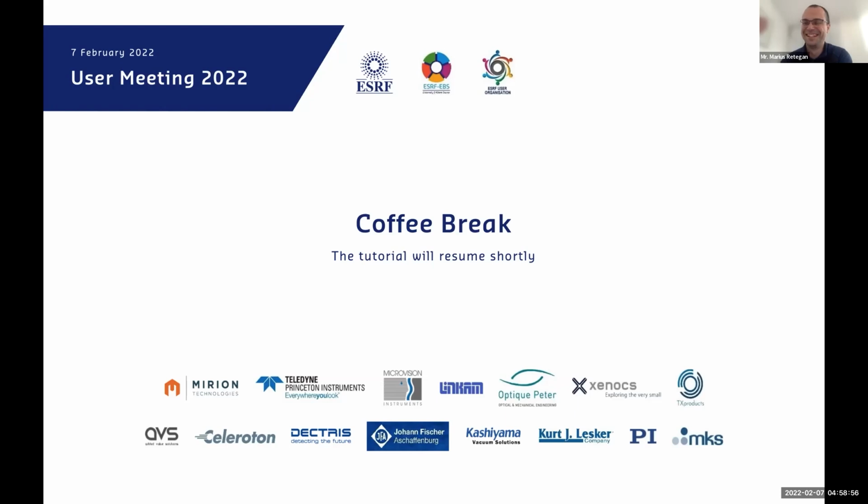General one. So your code was specifically developed for ID26, or is it broader? Yeah, because ID26 and ID20 have different ways of acquiring the data, different detectors.